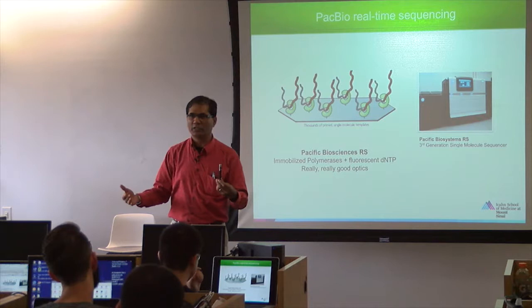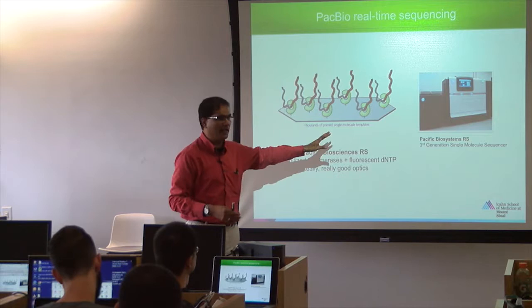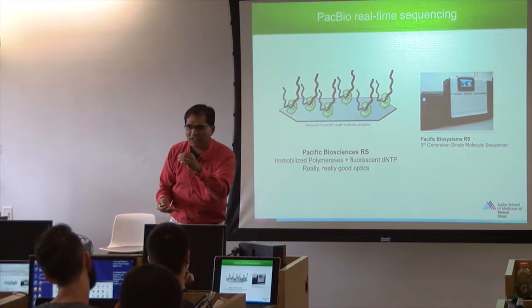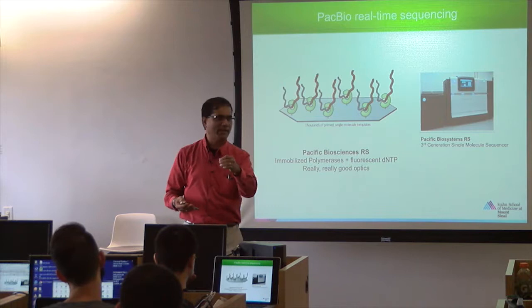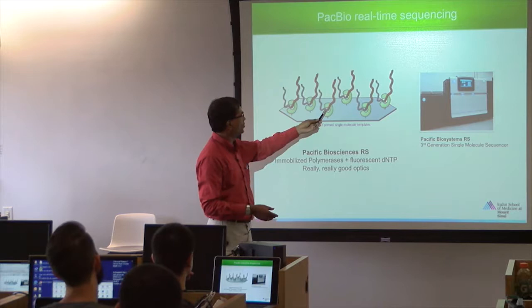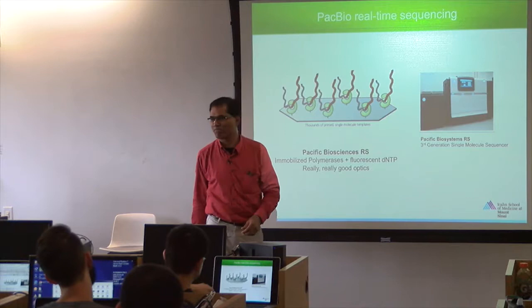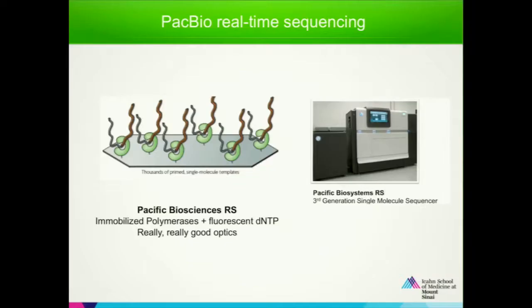Right? So if you want to videotape polymerase action, there you are taking the picture of the base addition on the DNA. But here you are trying to videotape the polymerase action. So you have to immobilize polymerase rather than DNA. If you immobilize polymerase, when the DNA goes through it, then you can detect that fluorescence. Once the DNA goes, a second DNA won't come. It keeps working on that DNA. Like that, the polymerase gets immobilized in those wells.